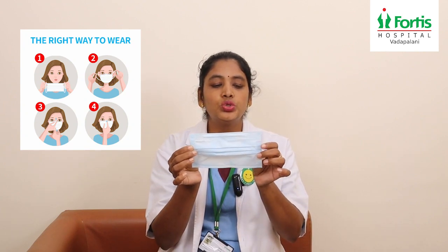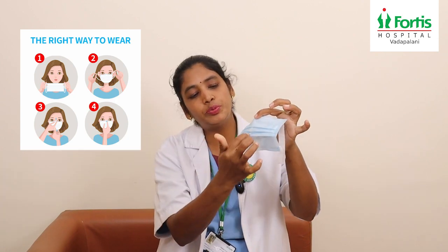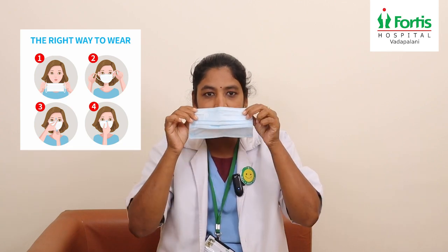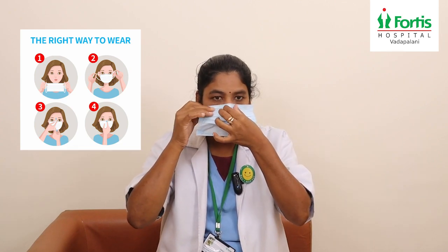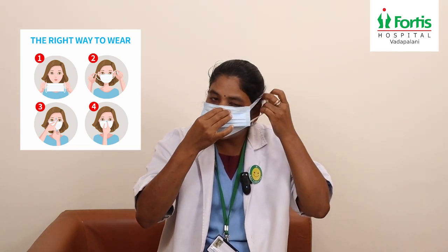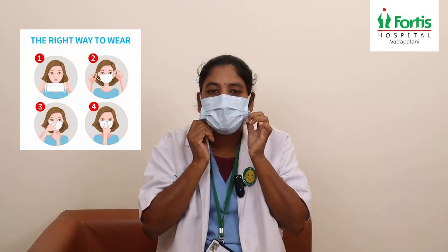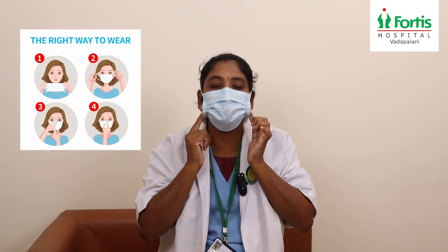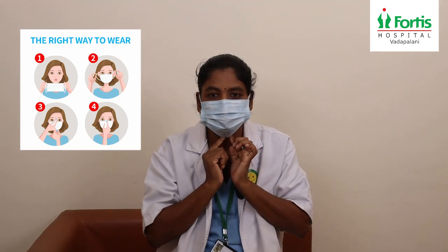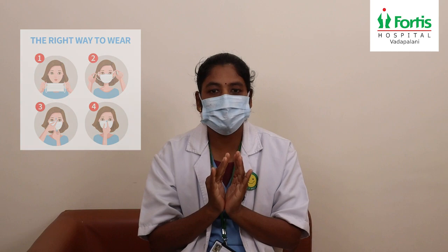The right way to use the 3-ply mask: take the mask and loosen the straps first, and then fix it on the nose like this. The colored portion will be on the outside. Fix it on the nose like that, and then cover with the straps on each side. Now you have to confirm whether the mask is fully covered or not. Now you can check that all the area is closed. Never touch the mask after wearing it.